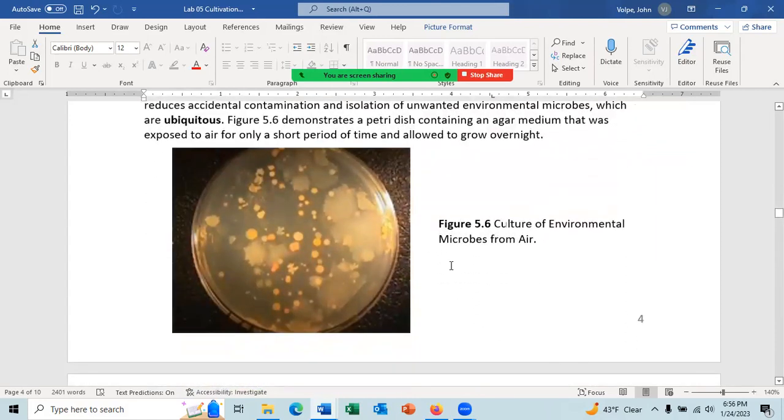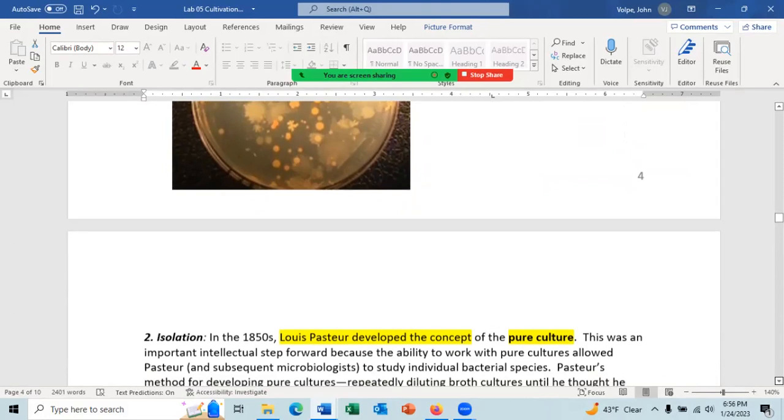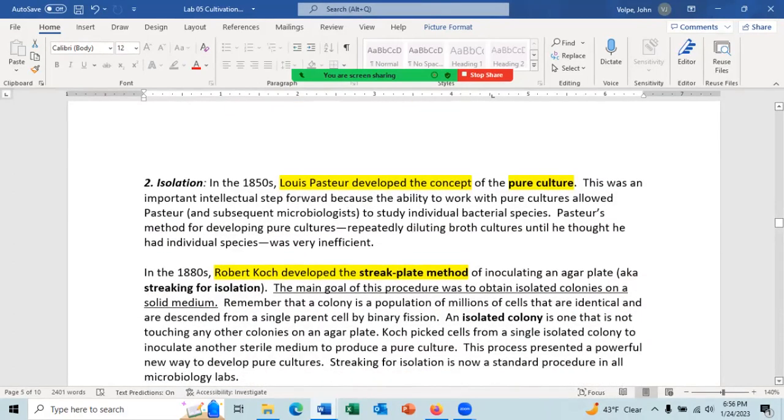All right, here's some microbes we've grown. For isolating bacteria, you need to do that and get a pure culture. Like when you're studying your unknown, if it were to be a mixed culture, you'd have to streak it out and make sure you get a pure culture before you start studying it. Because if it has 2 or more species, if the test is positive for a result, you don't know which species made the test positive. So you have to work with generally a pure culture.